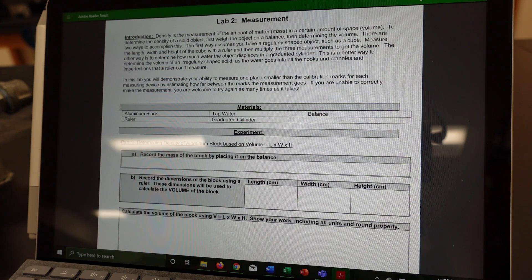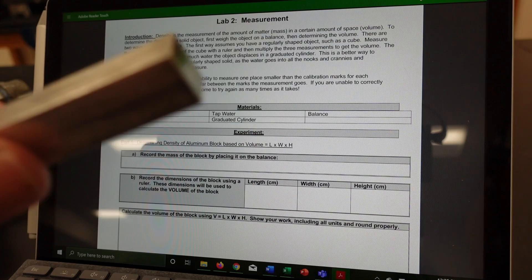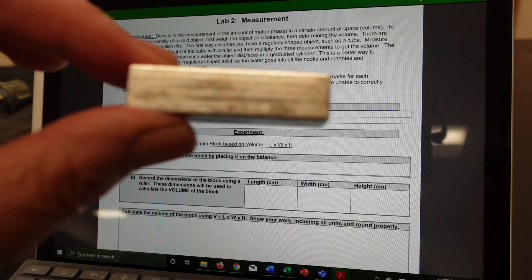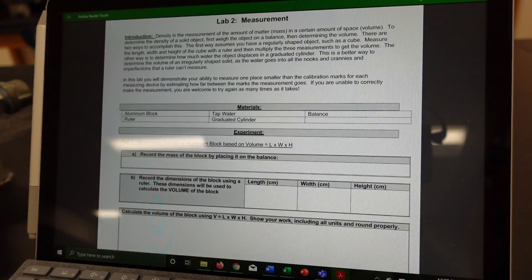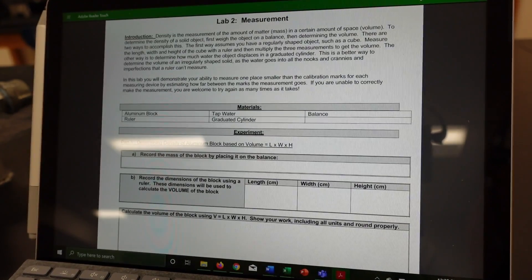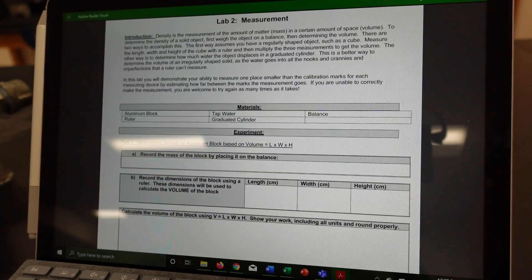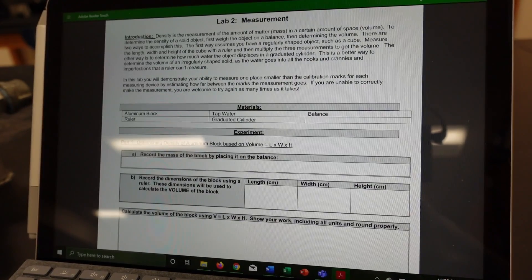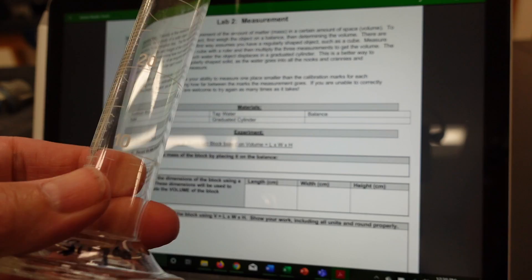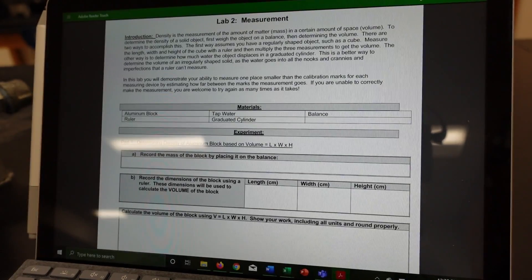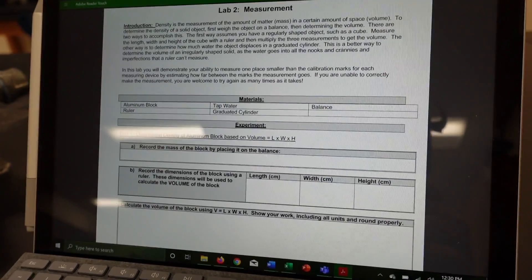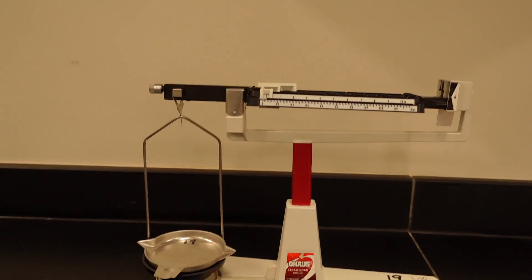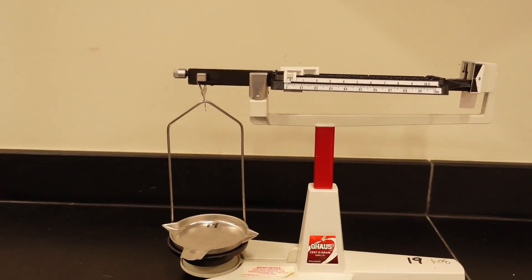Now, for this particular lab, we need the following materials. We need an aluminum block. We need a ruler. We need tap water, which will go into a graduated cylinder. And you will also need a beam balance, which I have right over here.